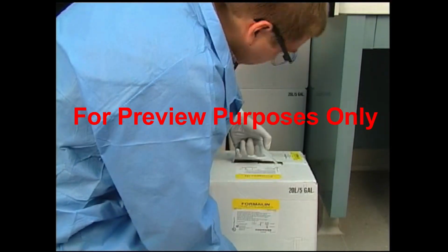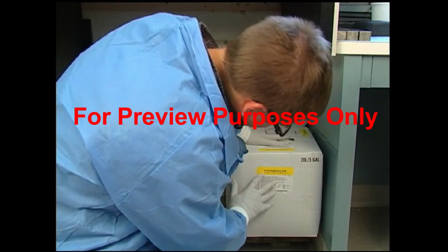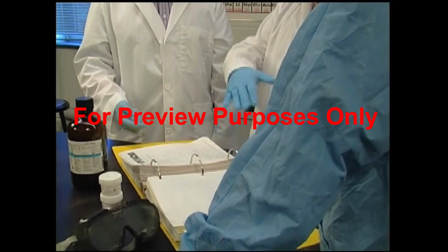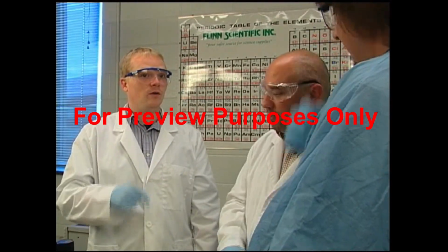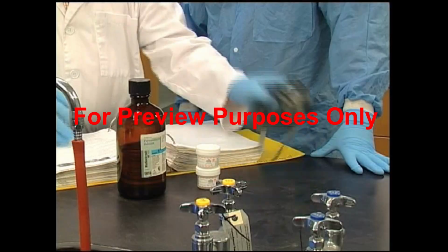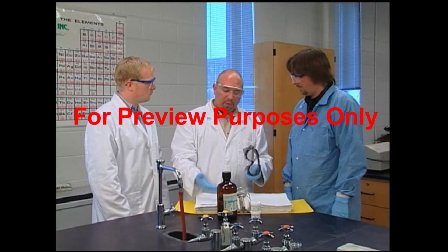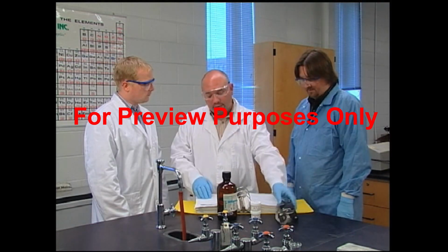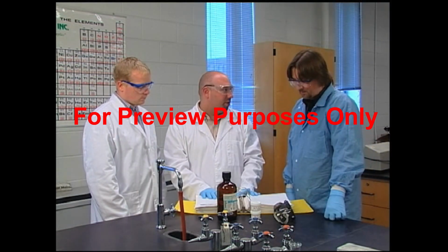Another important part of working safely with formaldehyde is following proper work practices. The safety data sheet is key. Be sure to follow all of the recommended handling and storage procedures for the formaldehyde material that you're using. It's also extremely important that you follow all of your lab's recommended procedures. They may require special protective measures, depending on the work you're doing. Remember, these practices and procedures have been set up for your benefit.